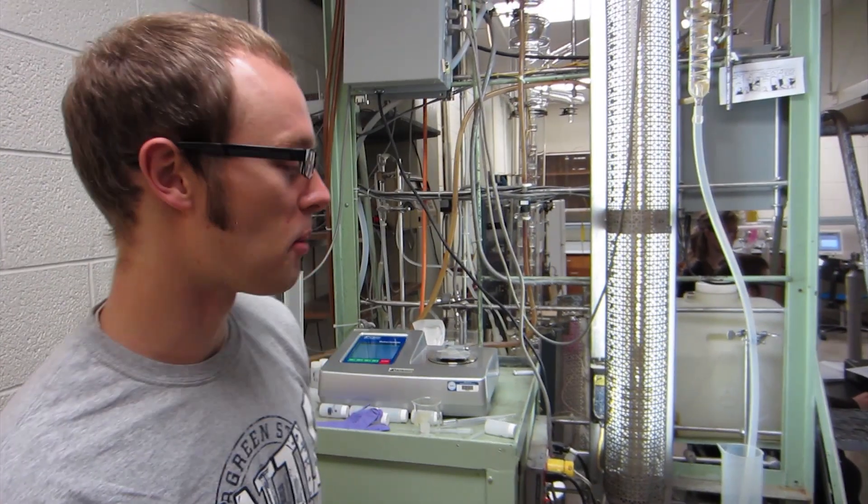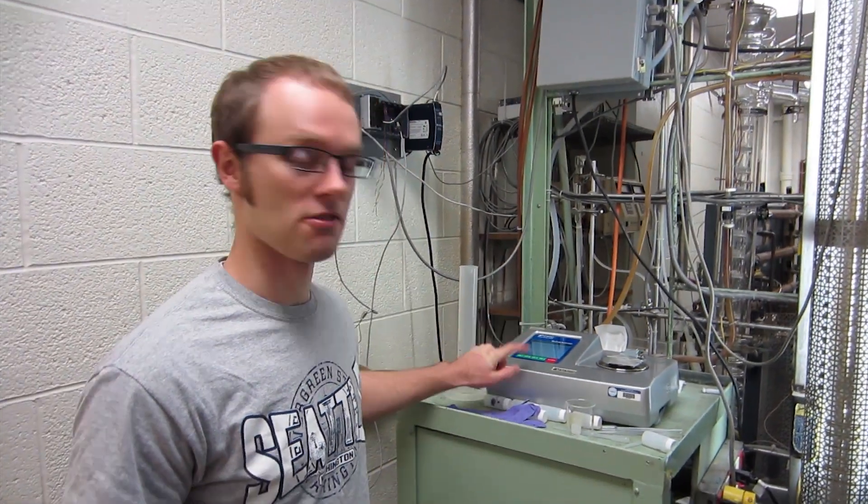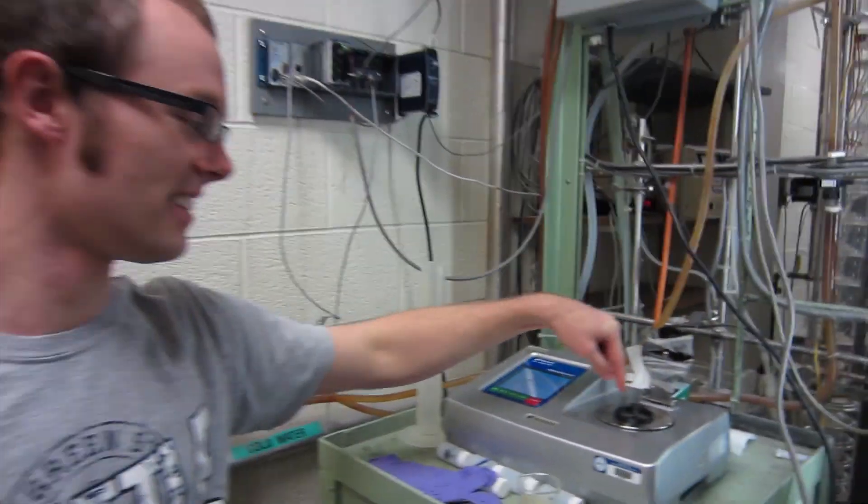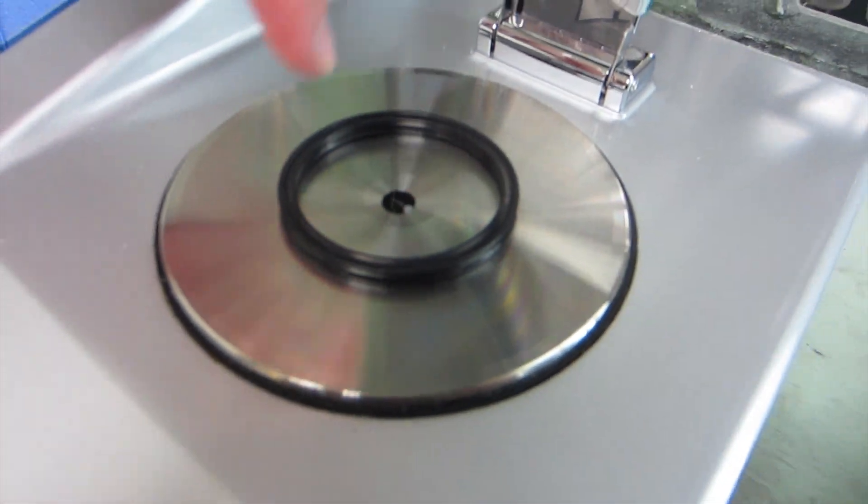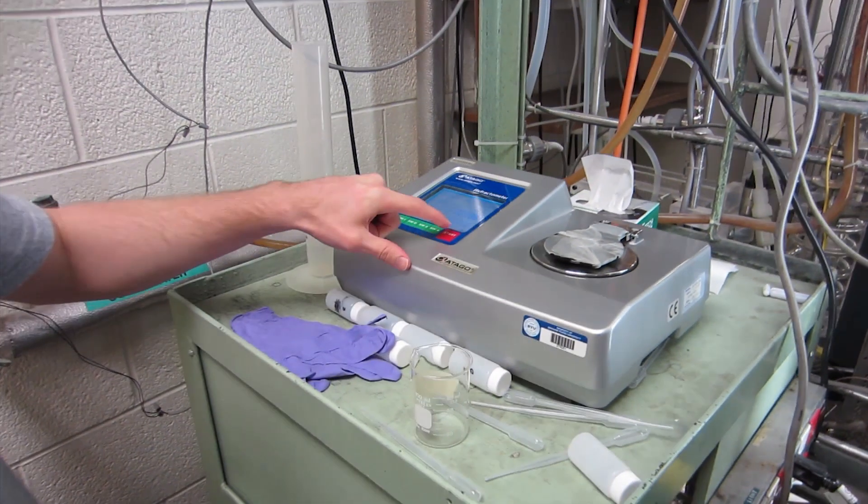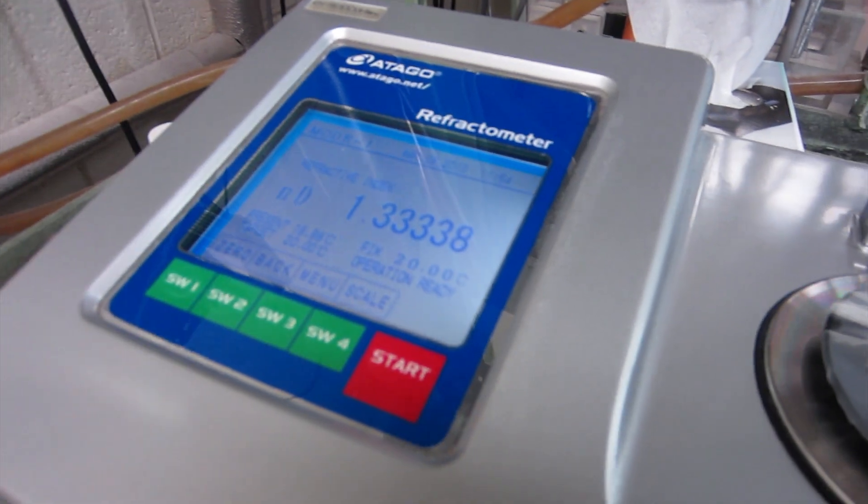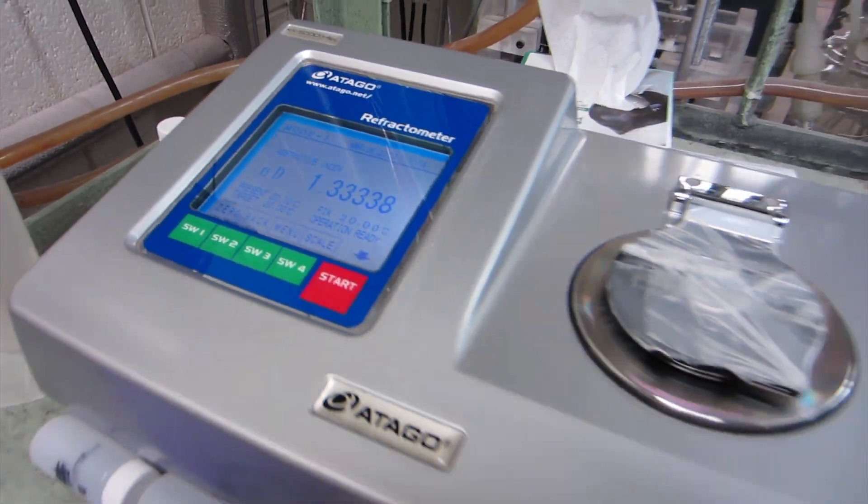To take a data point, we're going to use this refractometer. You put a little bit of sample right here. Close that and push start, and you'll get a value around 1.3. Then you use a correlation that's on the site to get your concentration of methanol inside your distillate.